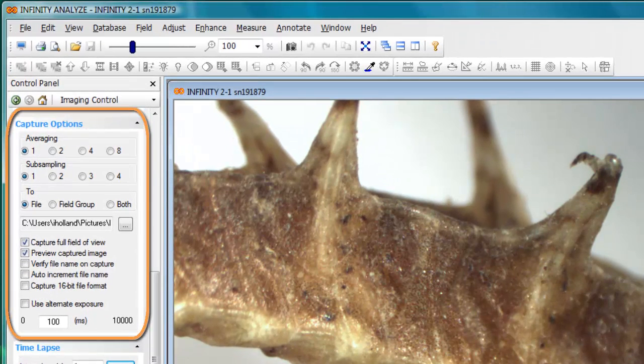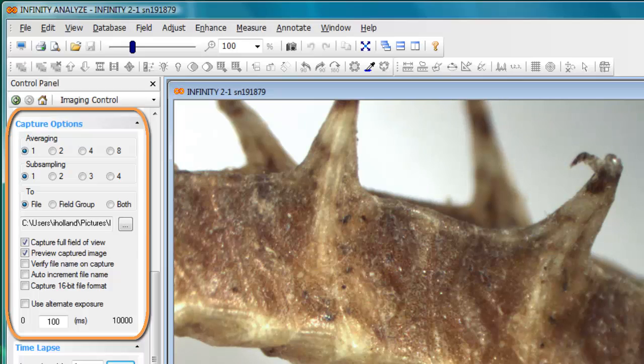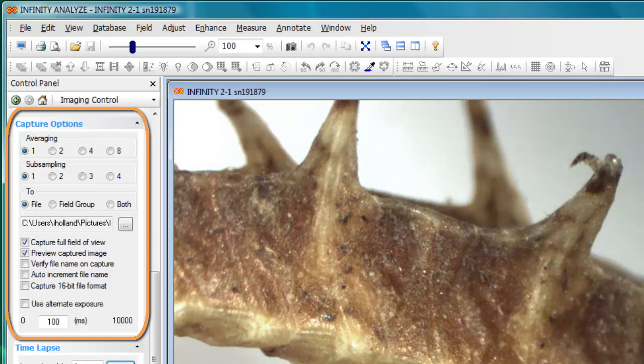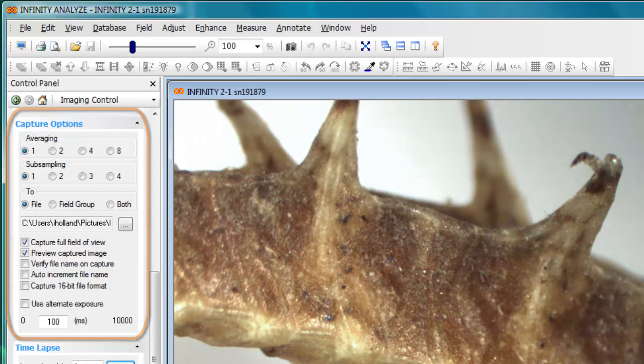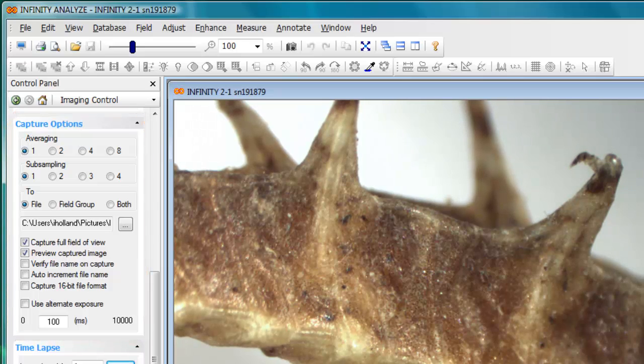These settings allow you to specify what happens each time an image is captured from the camera. We'll go through each option one by one to explain their function, providing you with the information necessary to decide which combination of these settings will give you the preferred results for your application.